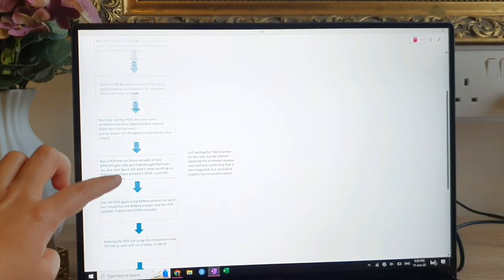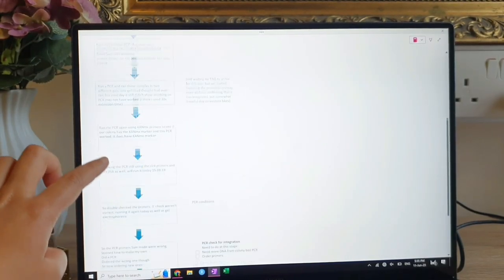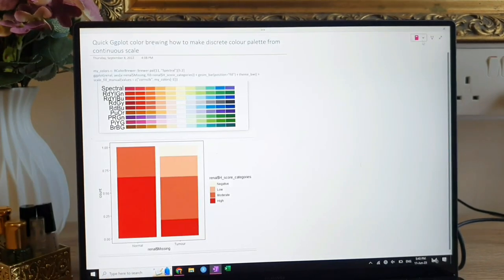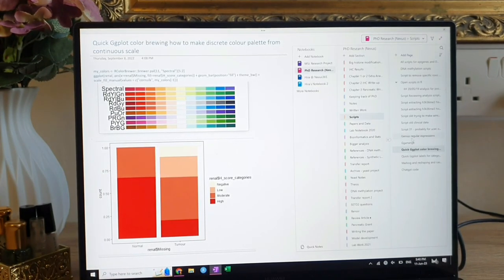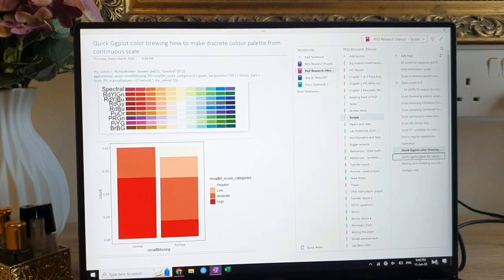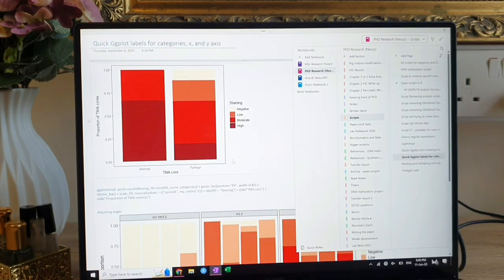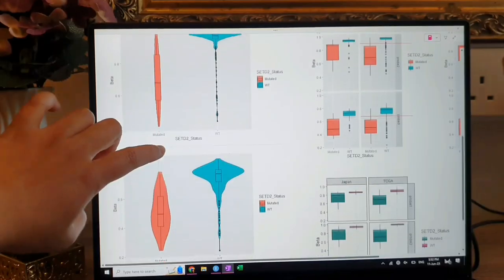Hi everyone, so today we're going to talk about using OneNote as a researcher. It's been my daily driver for my entire PhD. Every single thing that you need to do during your PhD, you can basically use OneNote for it.